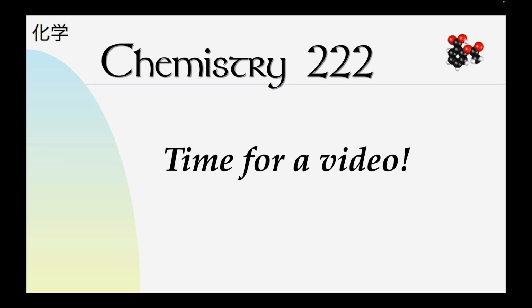At this point, I think it's time to watch a quick video to see how you would find the density of the unknown metal in the lab. This is the one lab component for this part.